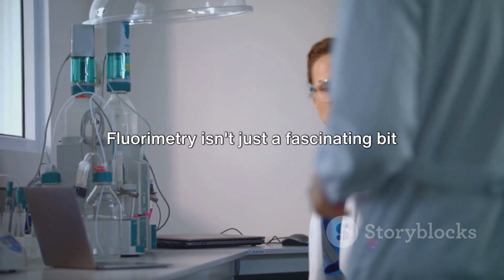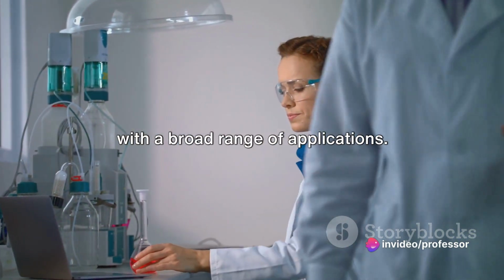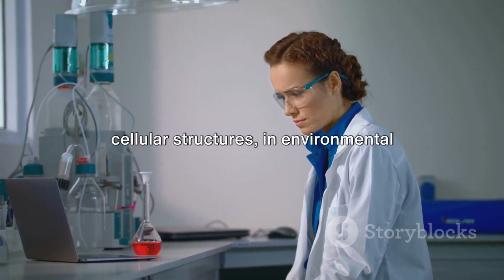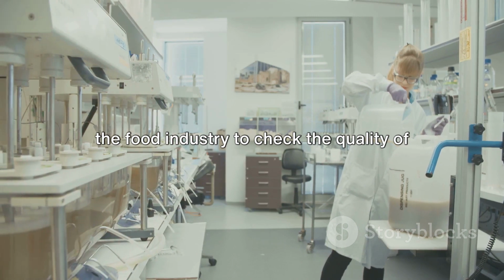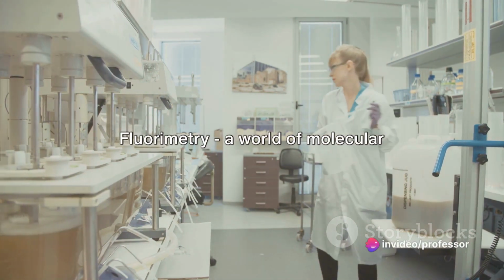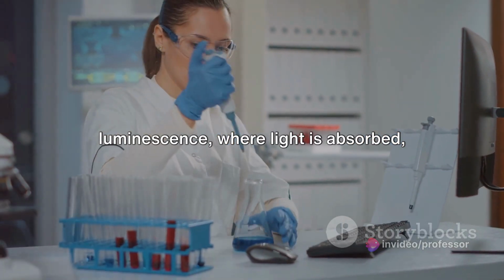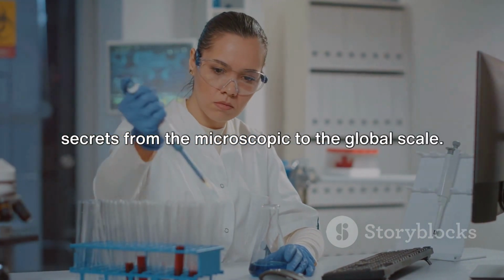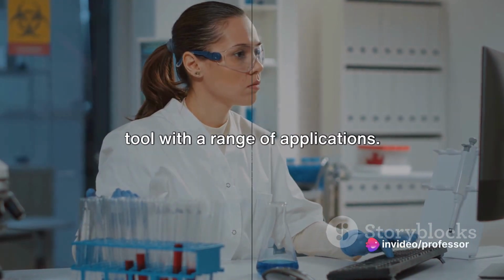Fluorimetry isn't just a fascinating bit of science, it's also a powerful tool with a broad range of applications. It's used in biochemistry to study cellular structures, in environmental science to trace pollutants, and even in the food industry to check the quality of our edibles. So there you have it, fluorimetry, a world of molecular luminescence where light is absorbed, transformed, and re-emitted, revealing secrets from the microscopic to the global scale. That's fluorimetry for you, a powerful tool with a range of applications.